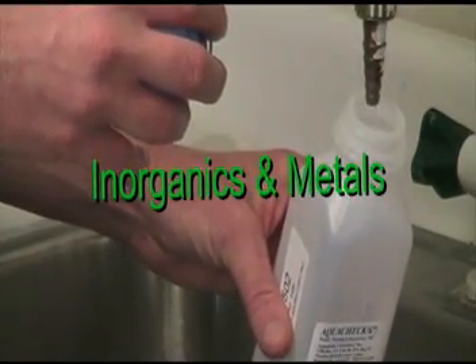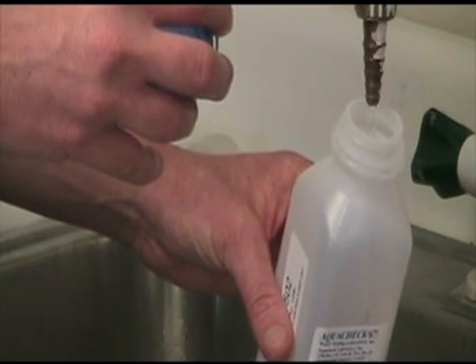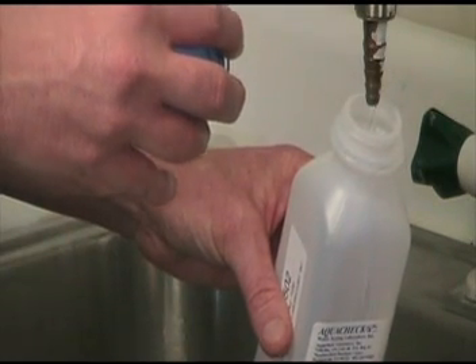Sampling procedures for inorganic samples such as nitrogen, metals, and physical characteristics like hardness, alkalinity, chloride, and pH are as follows.